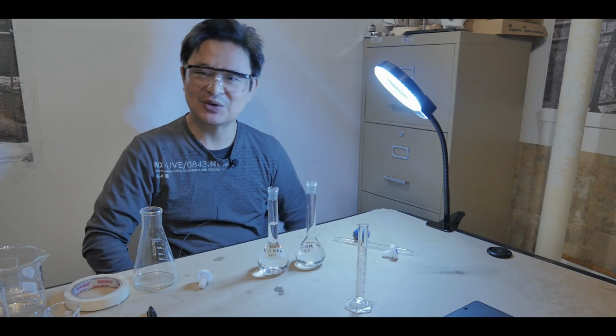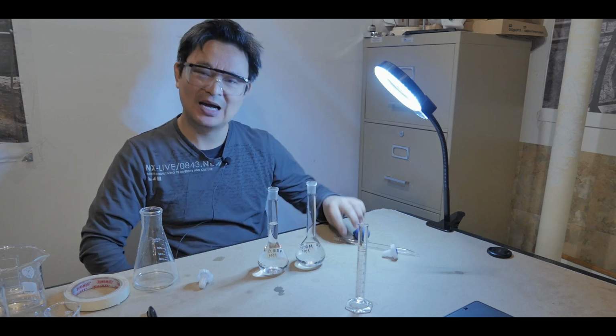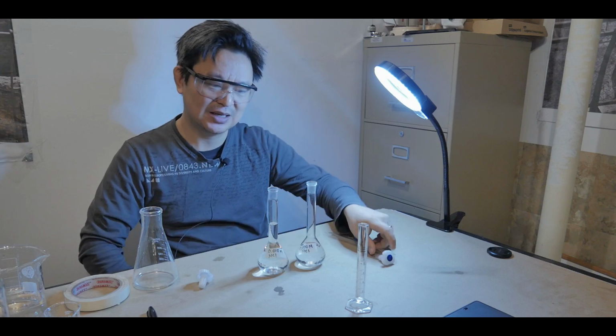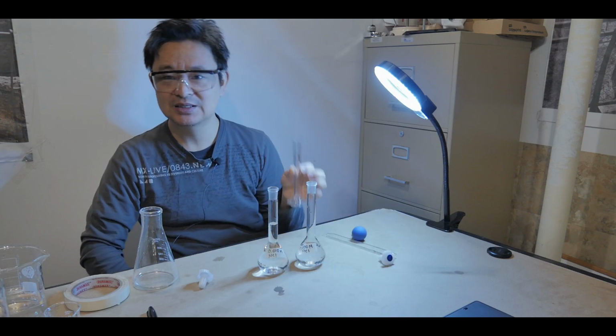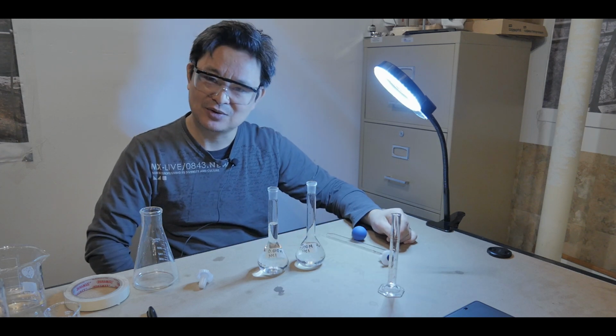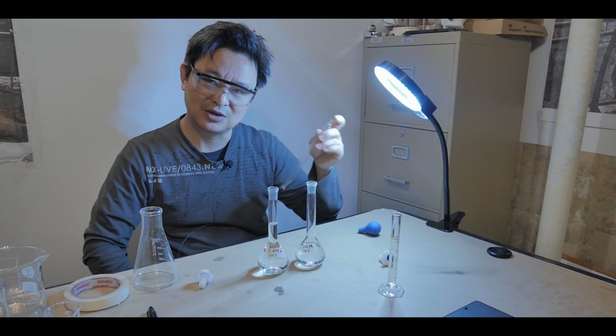Okay, pretty straightforward. But make sure you have the instrument for it, like the pipette. I think I would recommend it. If not, you can still use the graduated cylinder. It works as well, but you may not get the accurate result you wanted. But I think the pipette is a better choice.